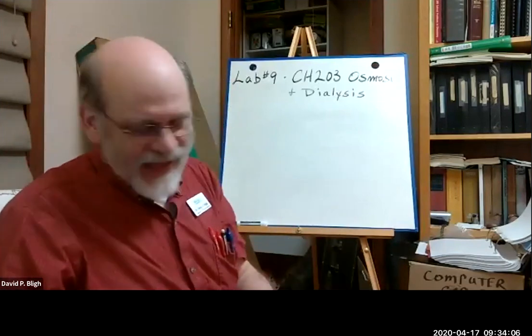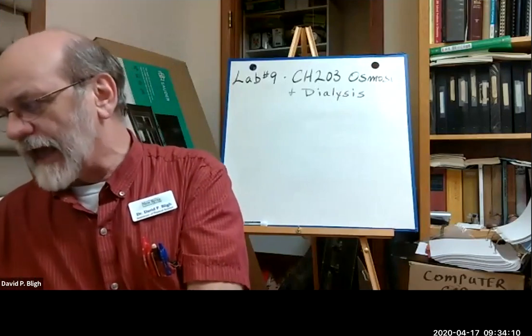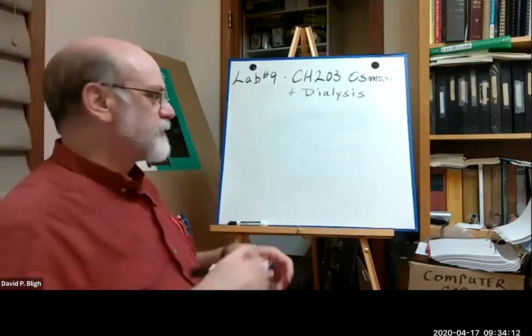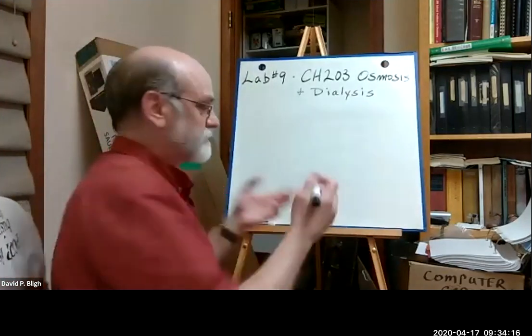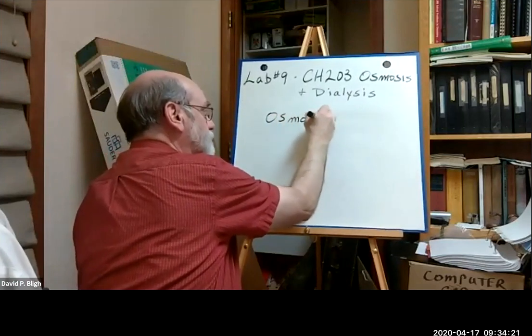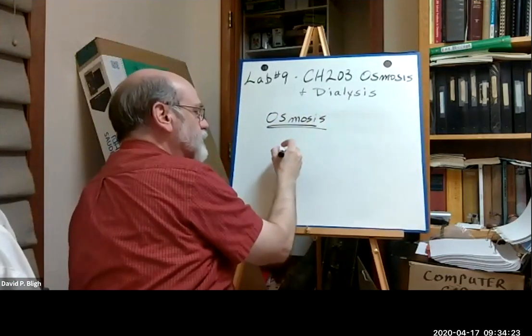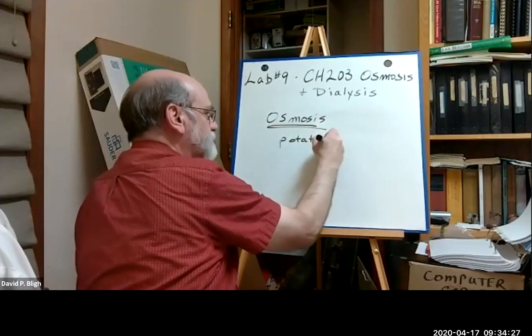Now, we talked about dialysis. Let's go back to osmosis. How are we going to study osmosis in the lab? So for the osmosis part of the lab, we're going to use potato plugs.